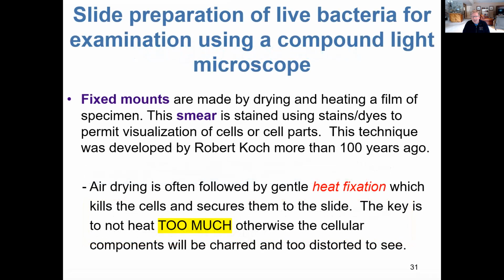We're going to be making some slides using bacteria coming up very soon. And typically what we do is, if the bacteria is coming from a liquid broth, we would apply that to the slide and let it air dry. If the sample was coming from a semi-solid material, like a plate, remember we looked at the plates earlier in this chapter, PowerPoint.